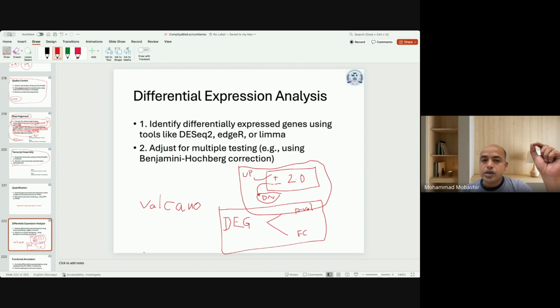When you have the differentially expressed gene list, you also need to prepare the output file for all the differentially expressed genes, with expression values in all the samples in cancer and normal tissues, fold changes in one column and p-values in another.